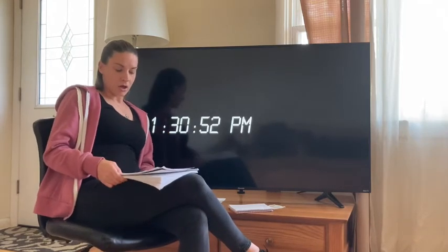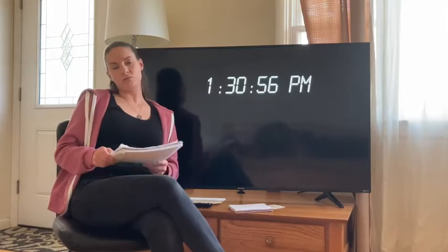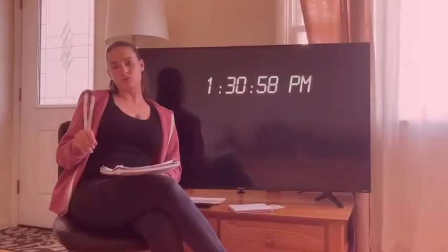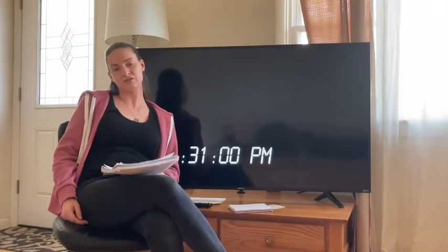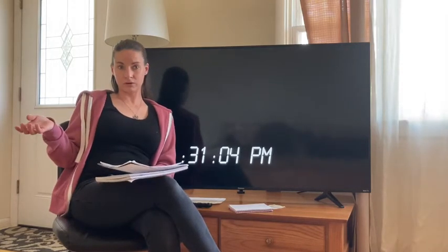All right, and then the next test involves a bile esculin plate.